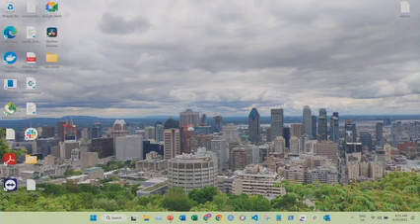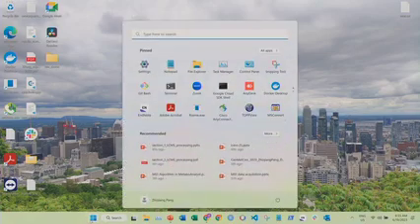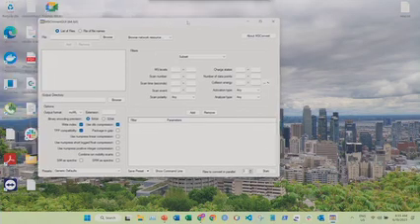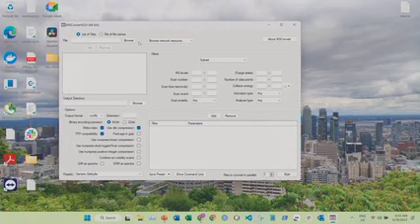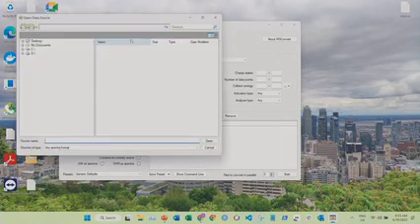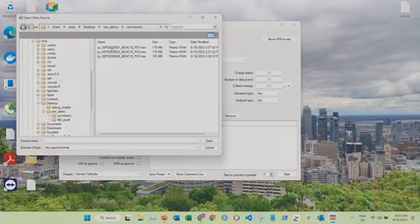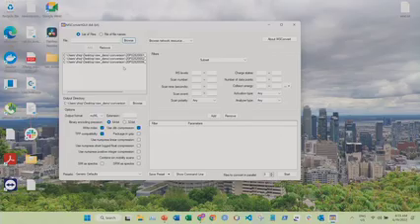So the most commonly used software to do the data conversion is MSConvert. You can download it from the ProteoWizard software. This is a very commonly used one, and it supports almost all raw data conversion. So here I would like to show quickly how to do the raw data conversion and centroiding. I provide three raw data files from Thermo Fisher, and we can quickly select all of them.